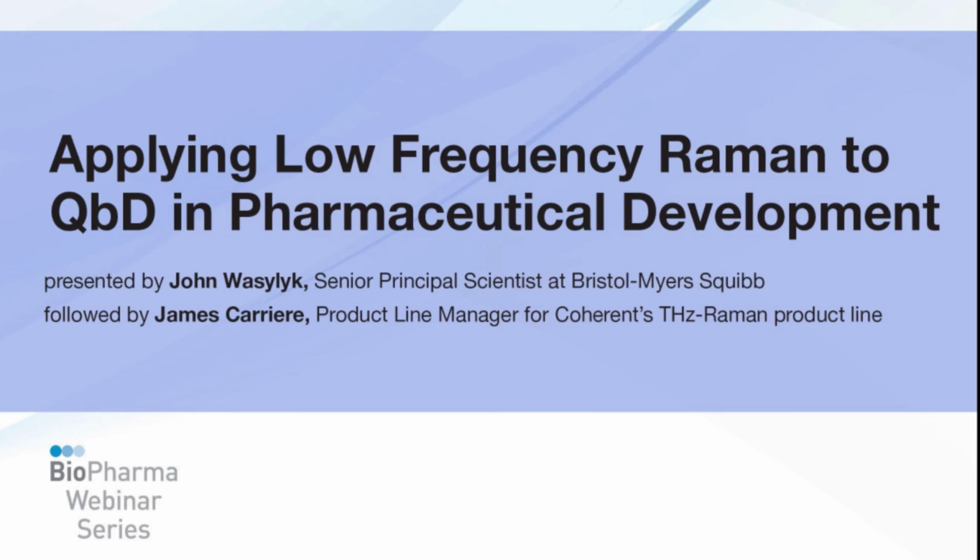We find that simple ratios and a simple PLS model works very well because you're normalizing it so you can address those concentration differences, because each batch, even though you're following a recipe, is going to have some slight variations in it. That's an entirely another discussion or talk, but there are ways to make really robust methods that enable us to transfer from small vessels to large, and we've been doing this actually for a number of years.